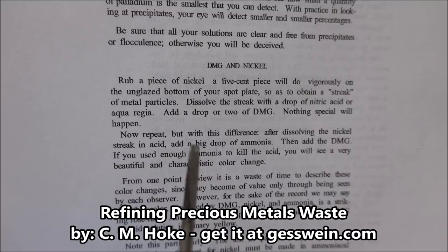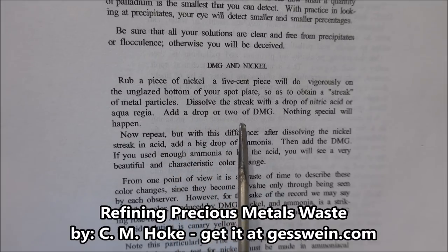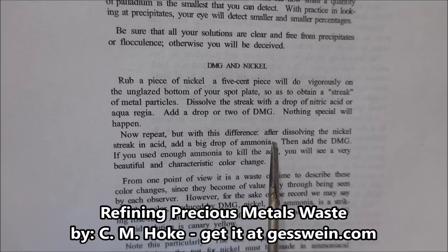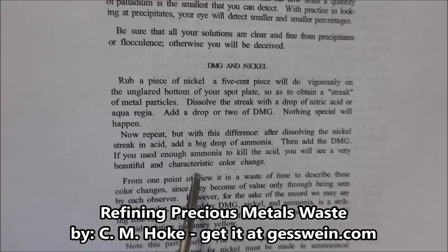Out of the same book, Testing for Nickel with DMG. It says dissolve some of the metal with a drop of nitric acid. We used hydrochloric instead. Add a drop or two of the DMG to that solution, nothing will happen. Now repeat, but with this difference. After dissolving the nickel, add a big drop of ammonia, then add the DMG. If you used enough ammonia to kill the acid, you will see a very beautiful and characteristic color change. It was a bright pink color.